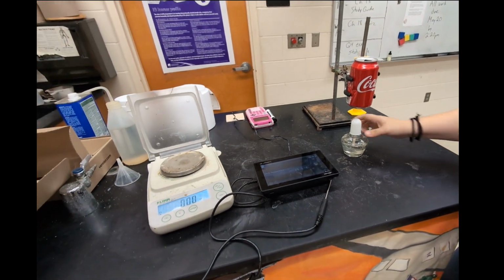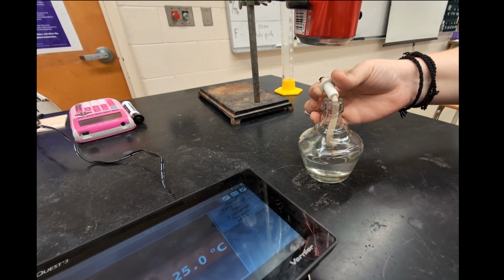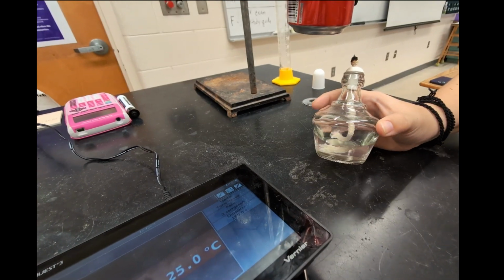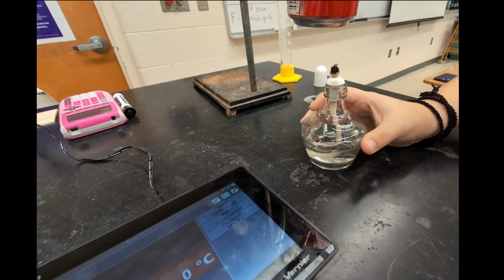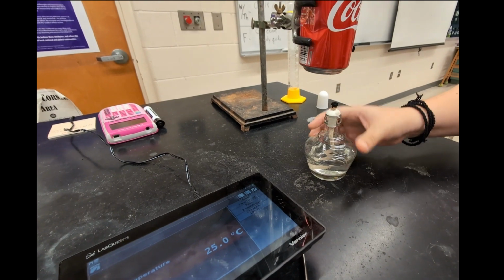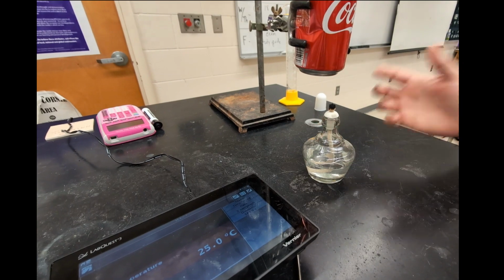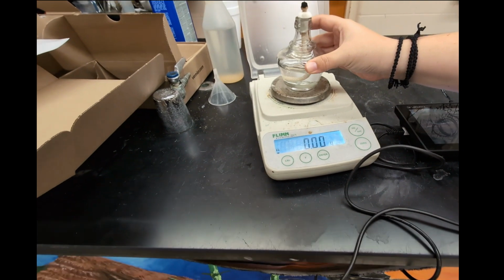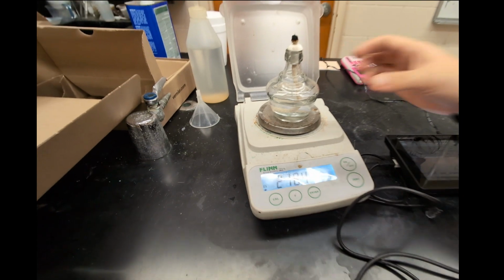And then in the alcohol burner, you can see that there is a cotton wick and a little ceramic cap. But in here there is ethanol, and it is denatured ethanol, so there is an agent in there that prevents people from drinking it, and the ethanol is soaking up into the wick. And you should have students record the mass of this whole thing before you start. So we have 218.40.